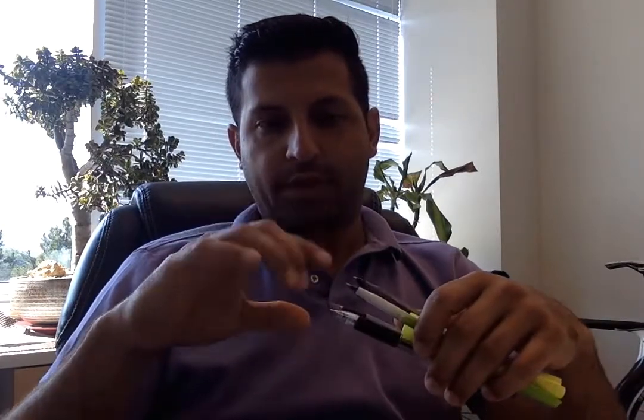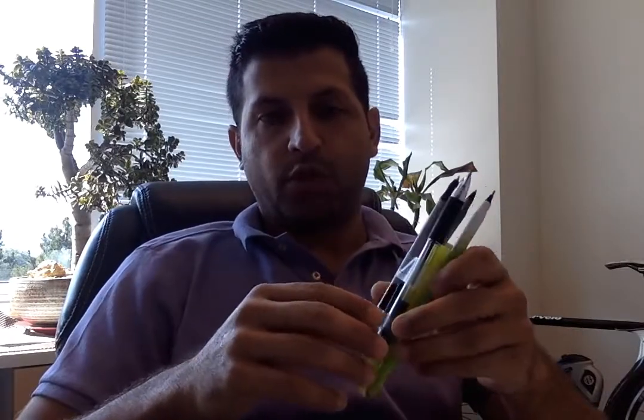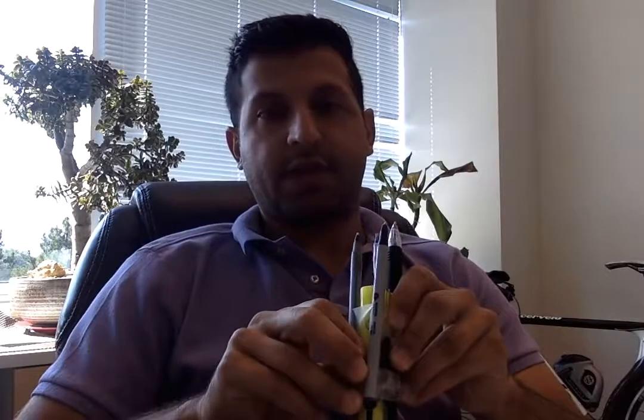And that way, when you feed the data into the spike sorting software, the spike sorting software will use a triangulation algorithm to determine which waveform belongs to which neuron. The same waveform gets recorded by all 4 of them, and then you'll be able to distinguish between them. So that's one technique that they use in recording from high density areas of the cortex, such as the hippocampus, and it really helps with spike sorting of these neurons.